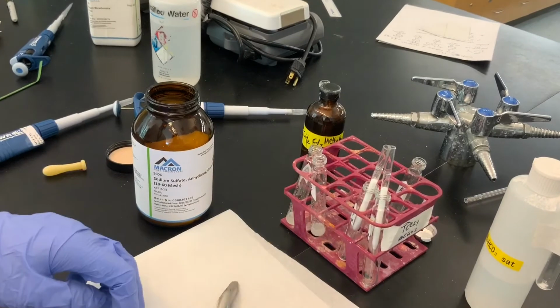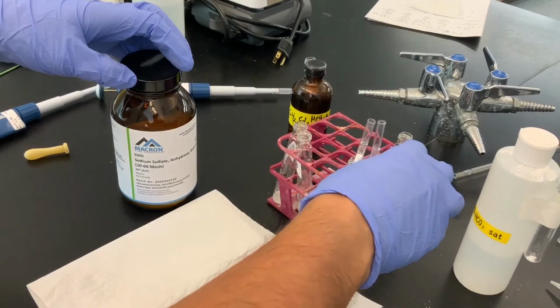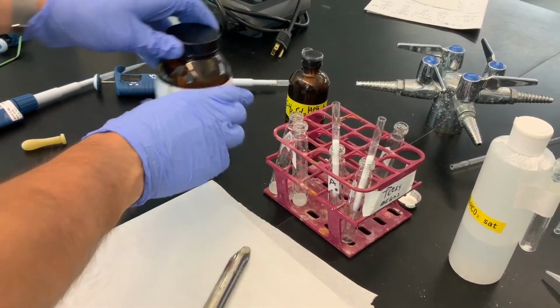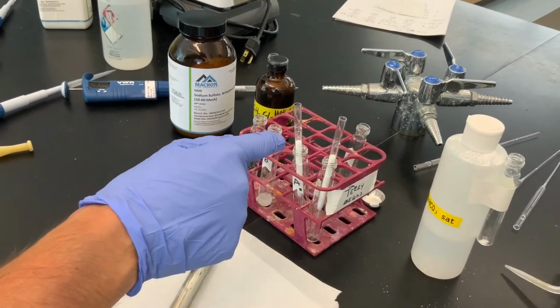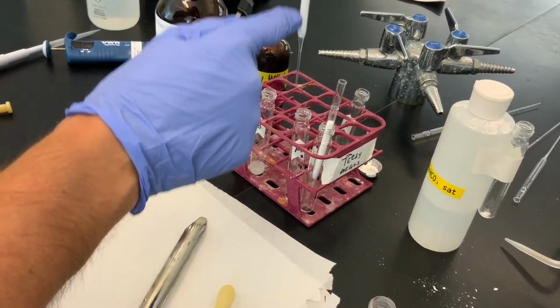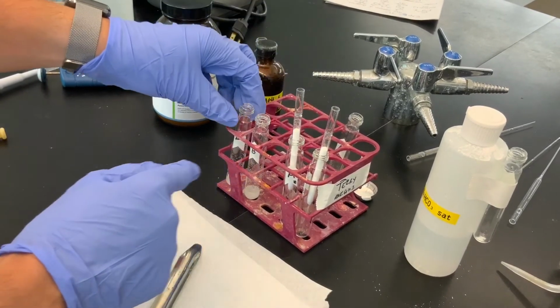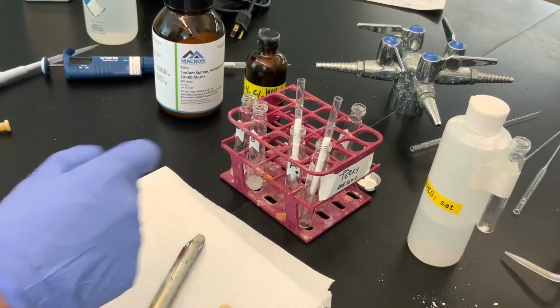All right, so we're going to let that be, and then once we're done allowing it to dry, we'll transfer each organic layer to the tiered culture tubes A and B. We are also, once again, going to rinse the test tubes for a quantitative transfer, and it'll also rinse our column of anhydrous sodium sulfate, right? Because this last part is going to dry anything that we missed and also act as a filter if our Pasteur pipette accidentally draws up some of the sodium sulfate.